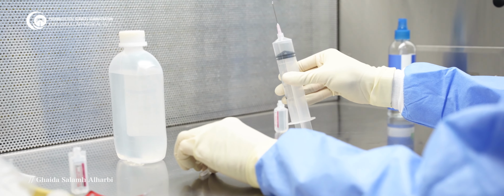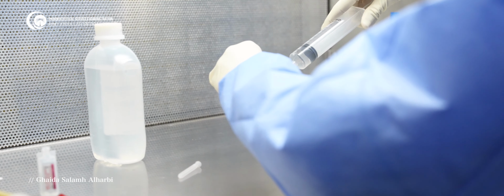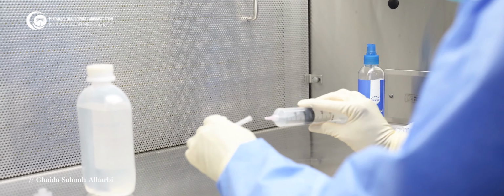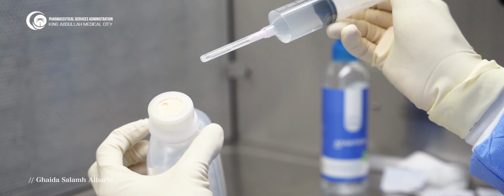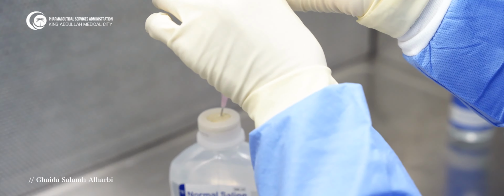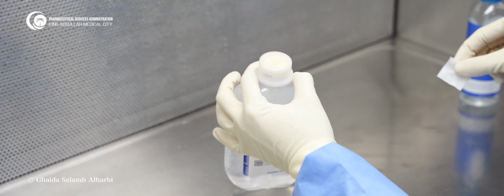Now the volume needed shall be withdrawn, then it will be transferred to the final bag. After adjusting the volume, we'll transfer to the bag. Take care that we have 2 circles inside, one for addition of the medication and one for administration. The small one is for addition of the medication. We will use it, and we will leave the large port, which is for administration, for nurses to use before administration.